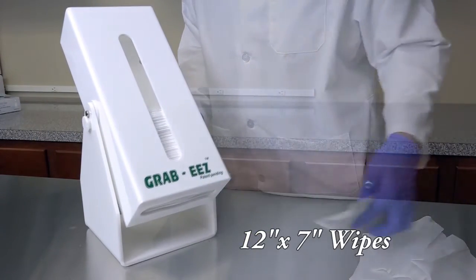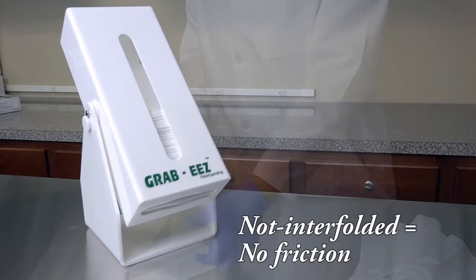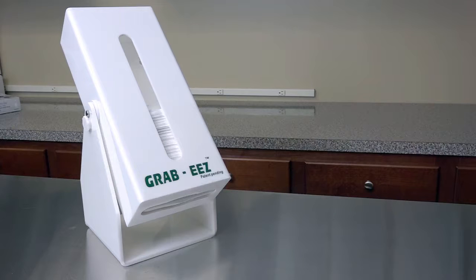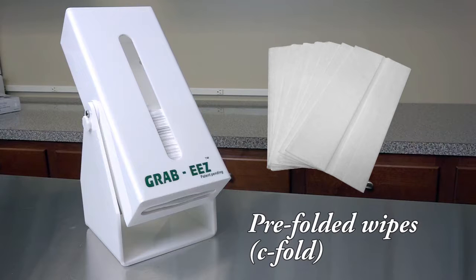The wipes are 12 inches by 7 inches, are not interfolded, so there is no damaging friction between wipes. Also, in most cases, the proper way to use a wipe is to use it folded. Grabby's wipes are pre-folded.